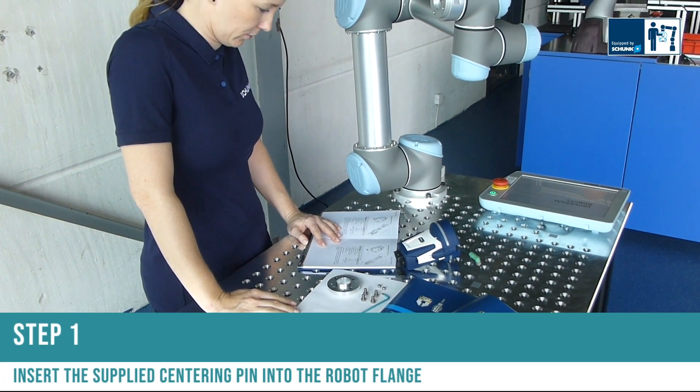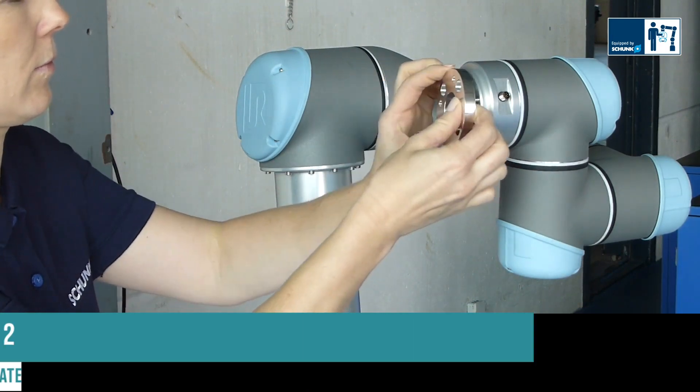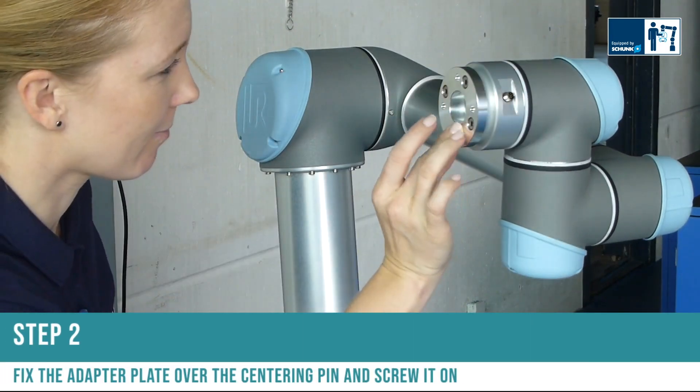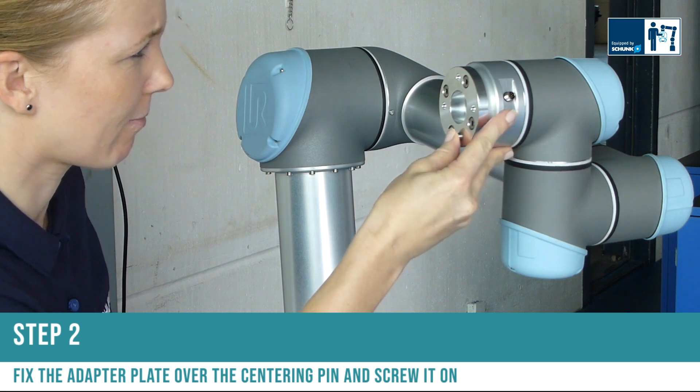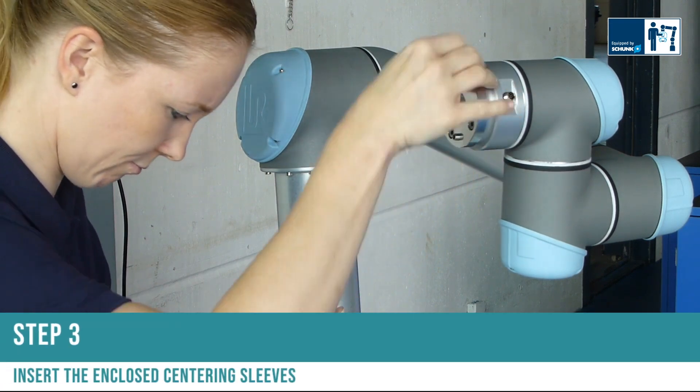Step one: insert the supplied centering pin into the robot flange. Step two: fix the adapter plate over the centering pin and screw it on. Step three: insert the enclosed centering sleeves.